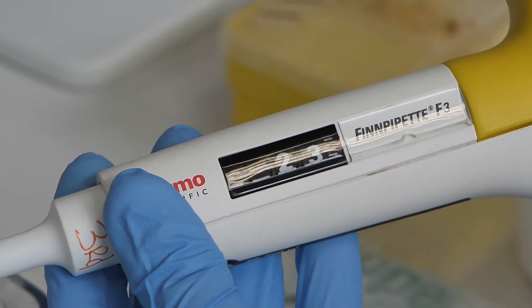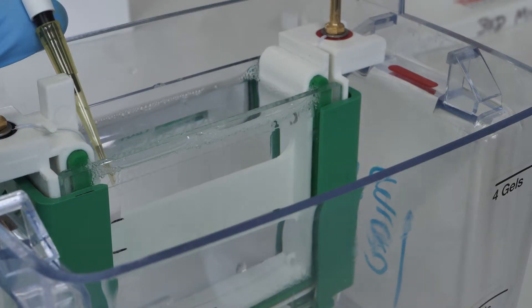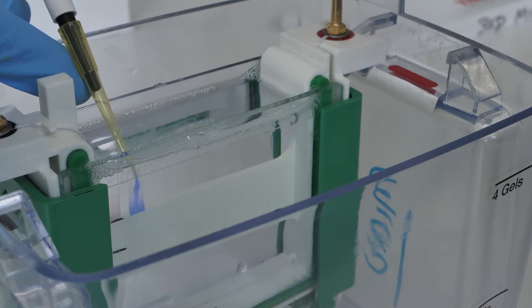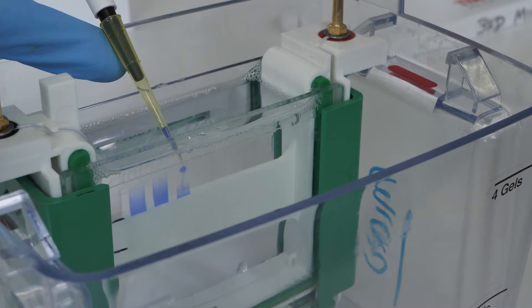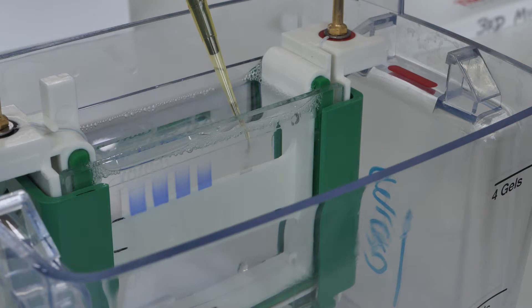Load 20 microlitres of each sample in the following order: Line 1 protein marker, Line 2 control, Line 3 time 0, Line 4 time 3 hours, Line 5 time 16 hours. Line 6 is left empty.